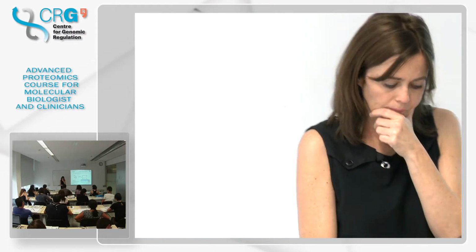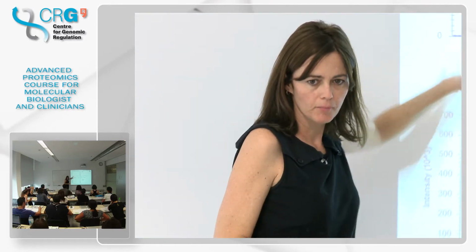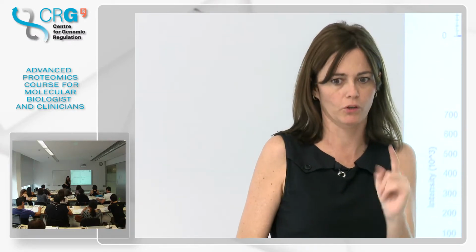Sorry, can you go back a slide? These chromatograms are actually going to be together, not divided like this. It depends, you can look at it in different ways. They're not doing different injections. No, this is one same injection, but in the software in which you are visualizing this data, you can look at it in different ways, and this is what you are going to do this afternoon. You're going to use this software.